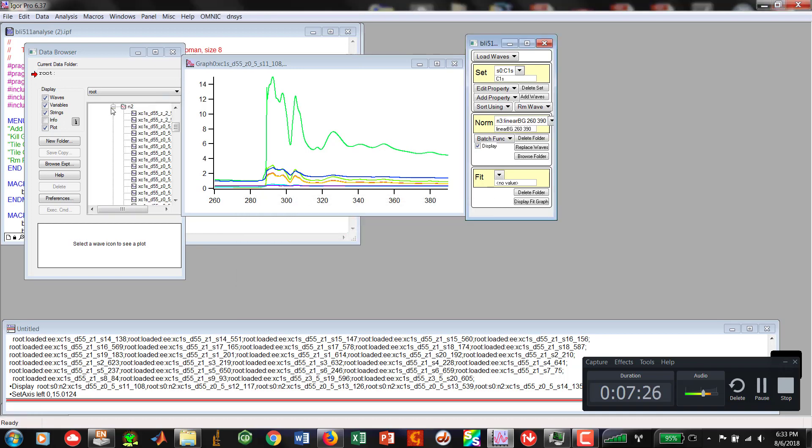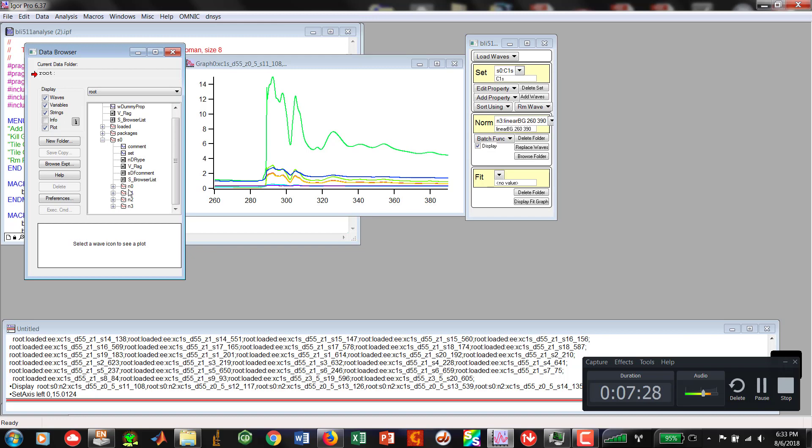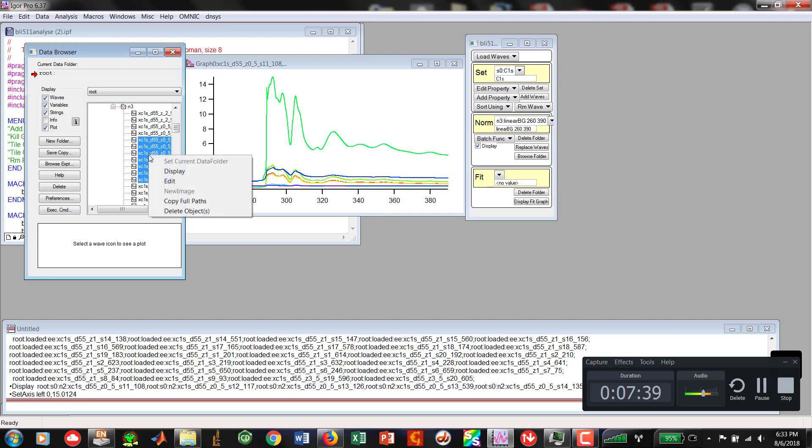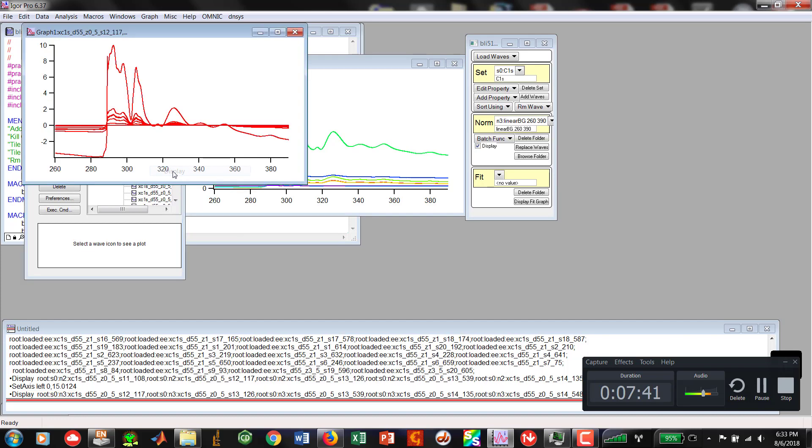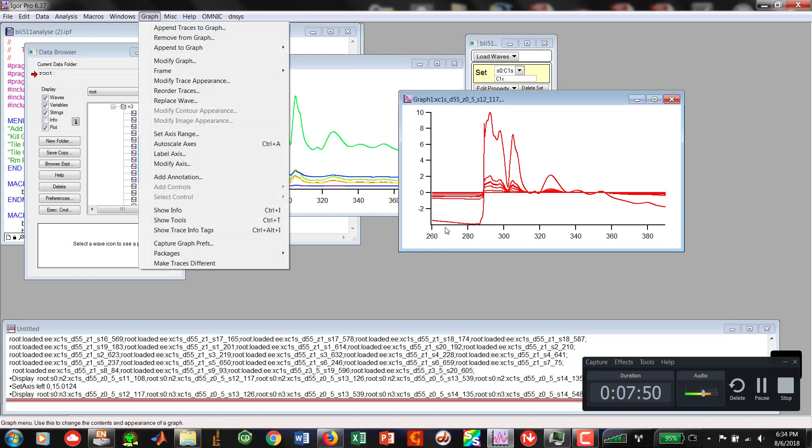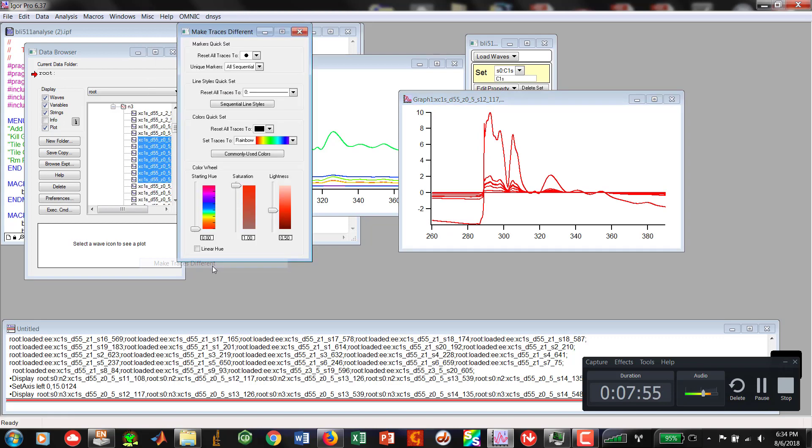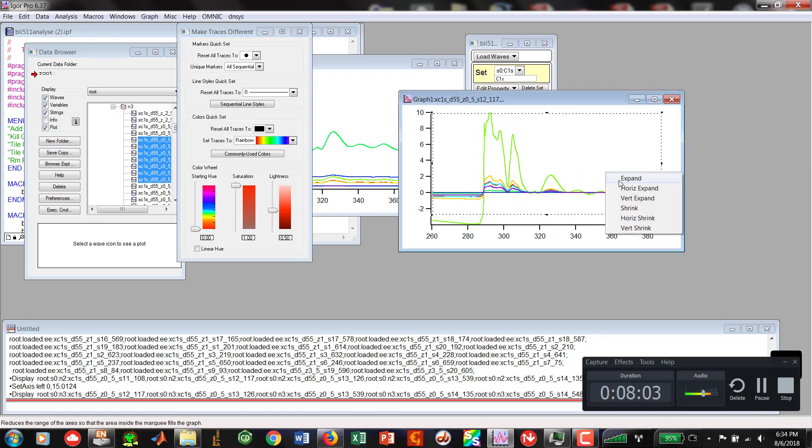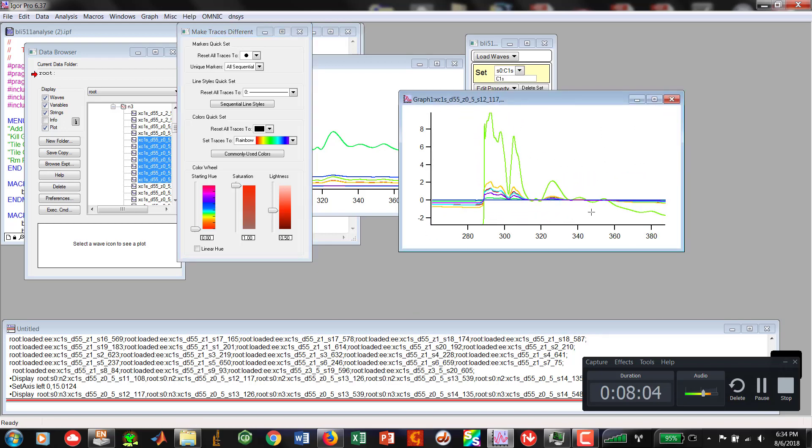Now if I go back, remember this is in N3. So you didn't see any changes right here. The changes are actually going to be in N3. And if I go ahead and click and drag across a couple of those guys that I recently did the work on, you'll notice that on this data set that we ended up having, some of them because of linear background effects, it got a little wonky. But on most of them, our background worked correctly and we're in that area where we're supposed to have our linear background subtraction.